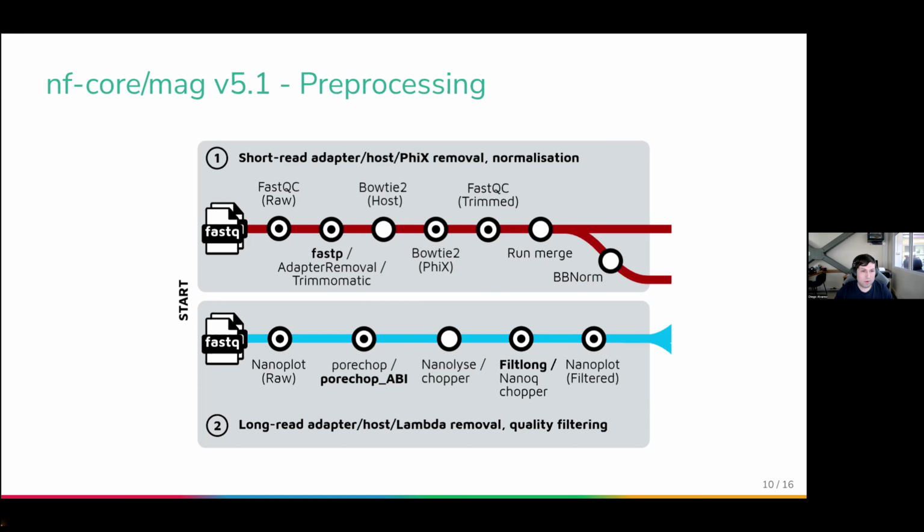And for long reads, we have quality checking with NanoPlot, Nanoq, and Chopper, and also adapter removal, etc.